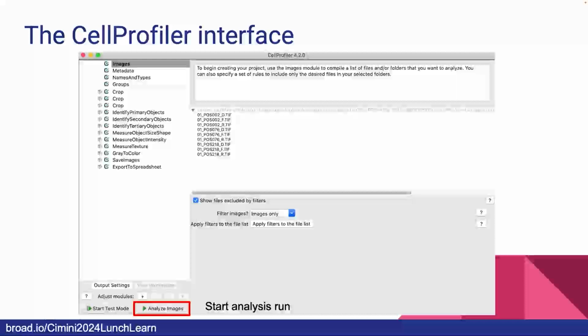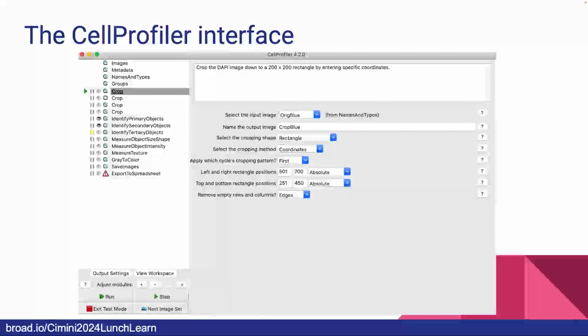And CellProfiler will analyze, again, however many images you have, whether that's 3 or 3 million. And then you can leave. You can go to the pub or go to get some free pizza or wherever it is you like to do with your day. And so that's what CellProfiler will allow you to do, and why it might be a good tool for some of you to do the analysis you want to do.